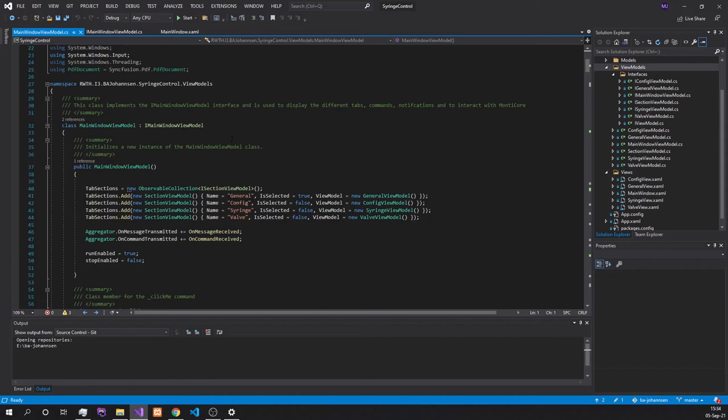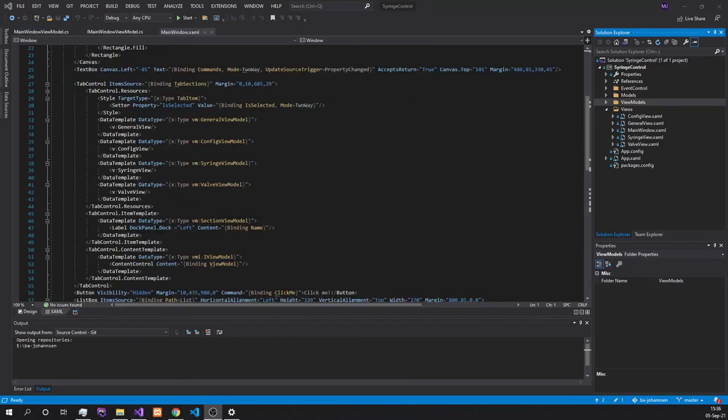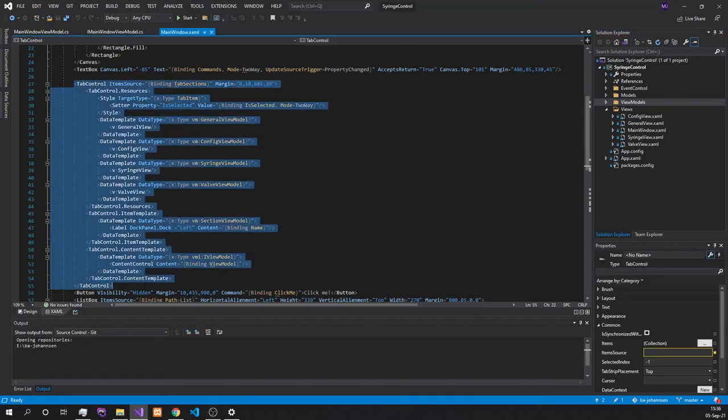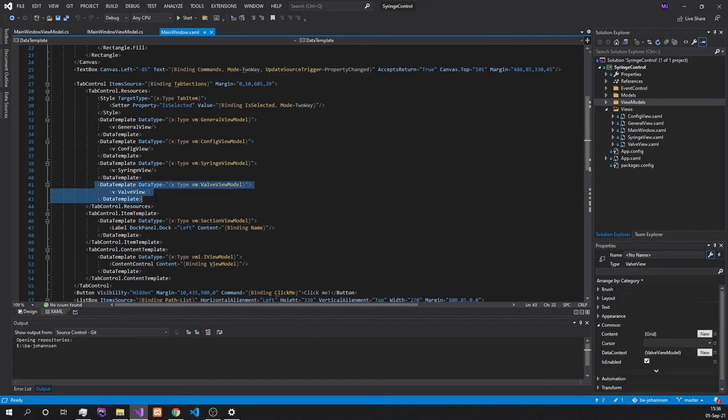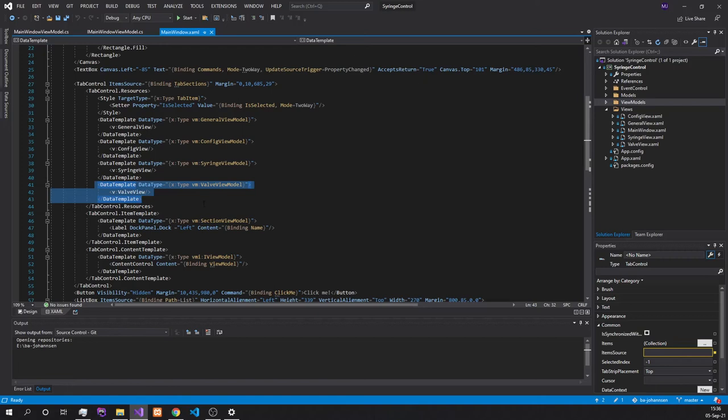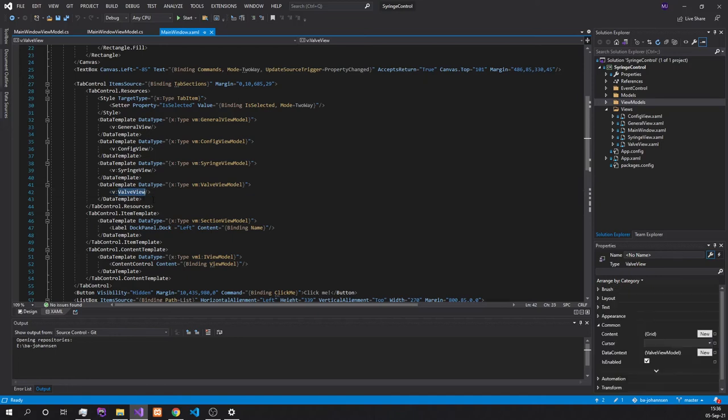Now, if the user wants to add a new tab, they need to add a new instance of this tab into the tab section's observable collection. To then have the tab display in the user interface, the developer needs to go into the main window viewmodel and then into the tab control section here. Here, the user needs to simply copy the data template and replace, for example, the valve viewmodel with the name of the new viewmodel, as well as the valve view here with the name of the new view.